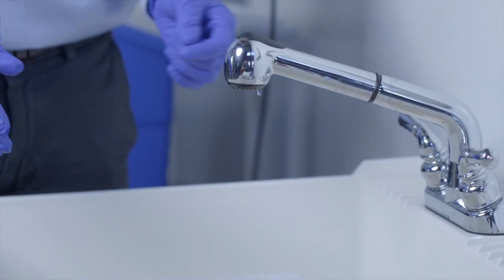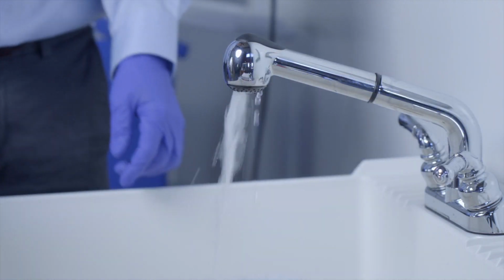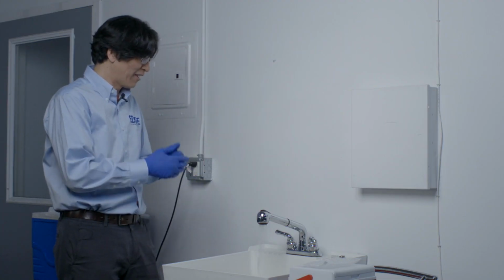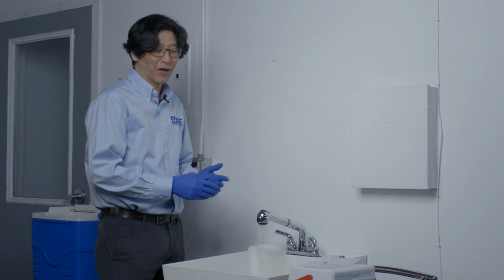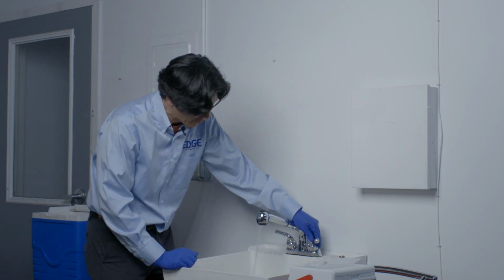Now what we want to do is get a nice stream of water. So we're going to turn on the water at a good flow. We want to run the water for about 3 minutes, and that way what we get is a nice equal temperature for our water. Once we get the nice water and a nice flow with a good temperature, then we're going to take our sample. So in order to expedite, I am going to actually take our sample at this point.